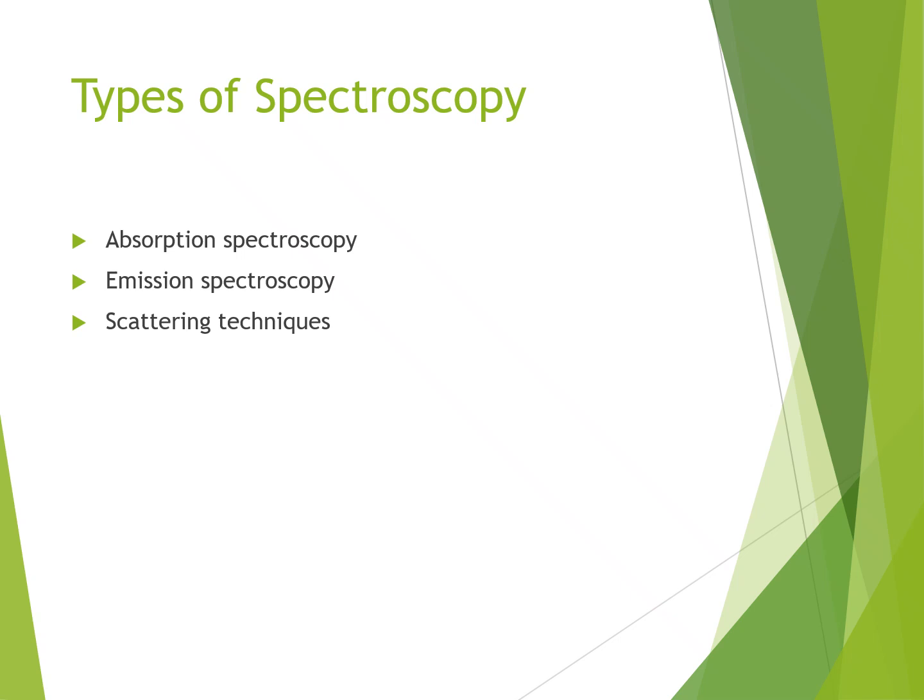As we are studying the basics of spectroscopy, spectroscopic techniques are broadly classified into absorption spectroscopy, emission spectroscopy, and scattering techniques.